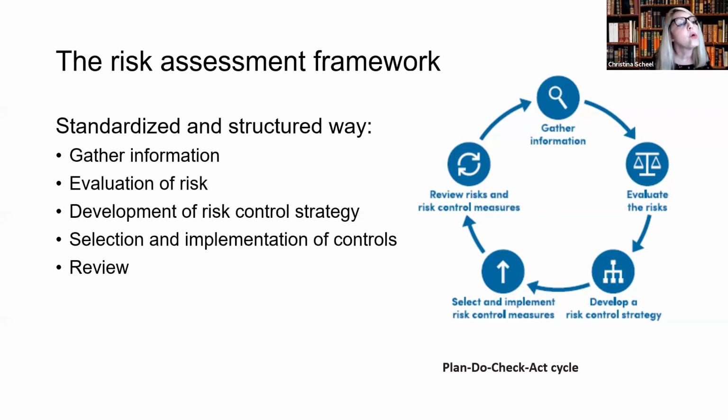This is especially important when changes are made to a procedure or equipment or staff, or if an incident has occurred, which would indicate the need to review the measures you have in place. And it's a circular process, not linear. It's a plan, do, check, act cycle.